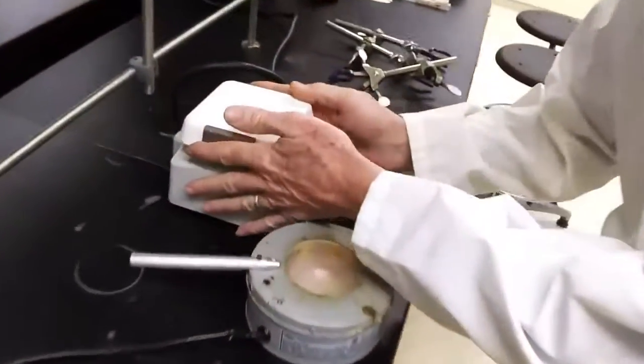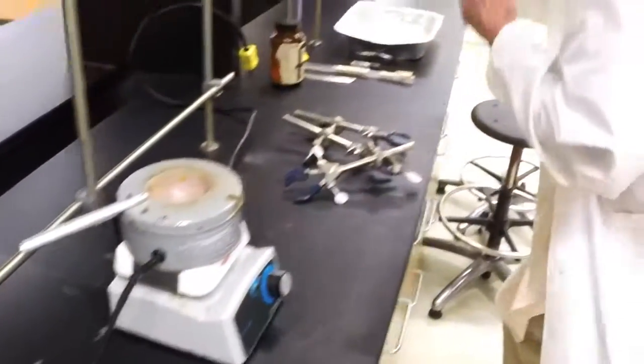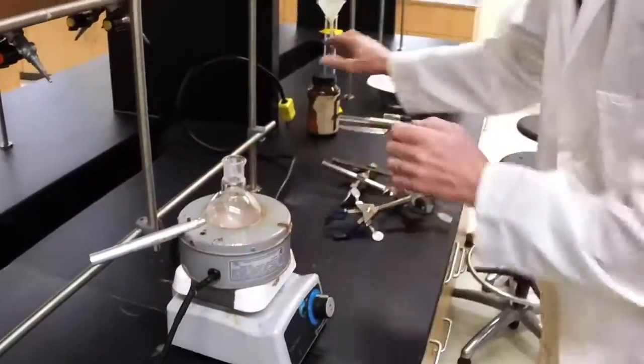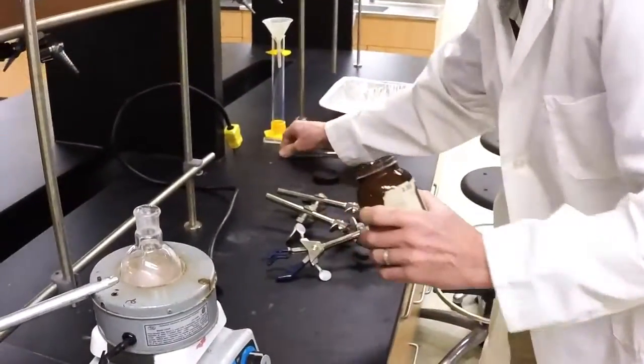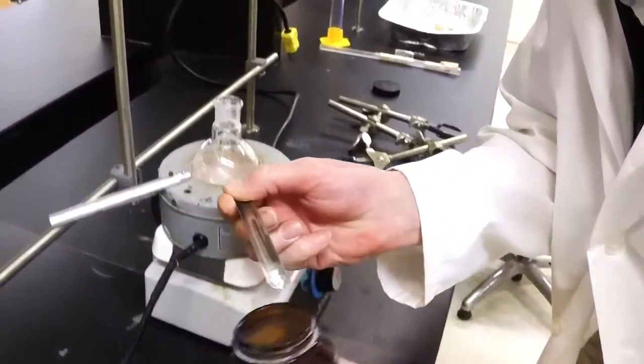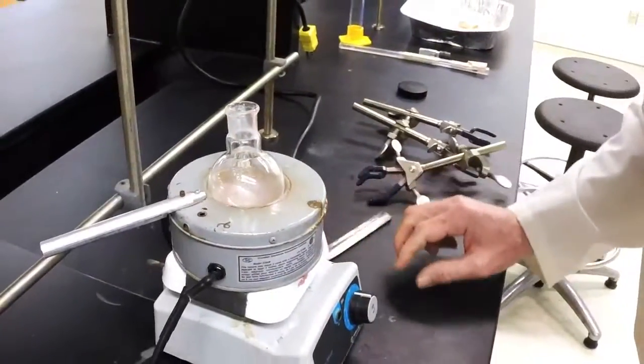We start with our stir plate and the heating mantle goes about there. You need a 100 mL round bottom flask. We require boiling stones — boiling stones make everything go smoother — so in they go, just about a half dozen.